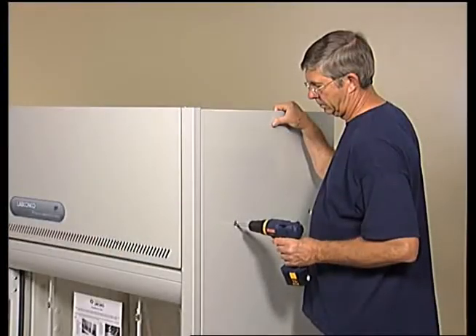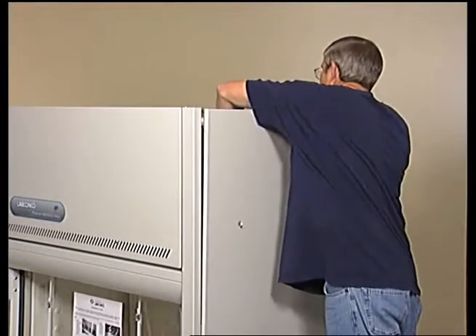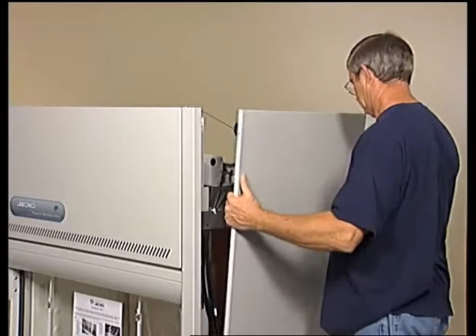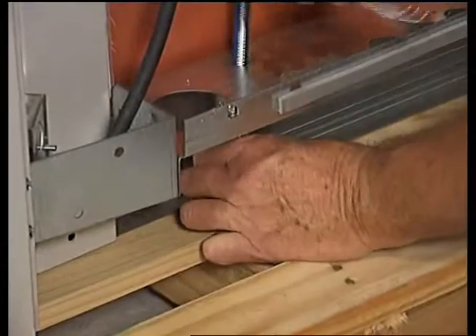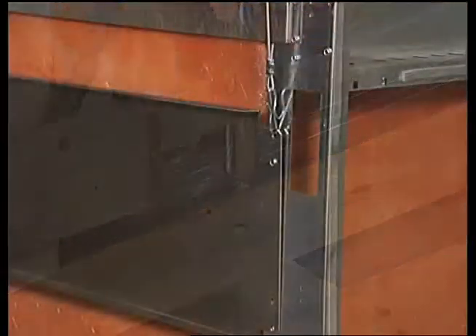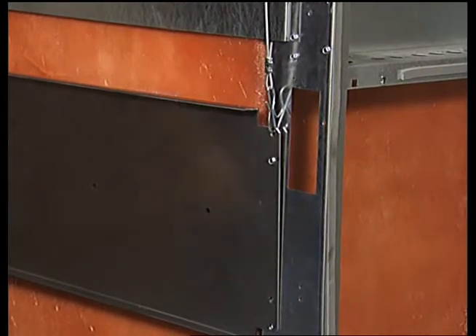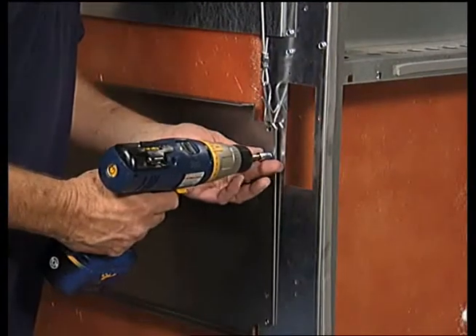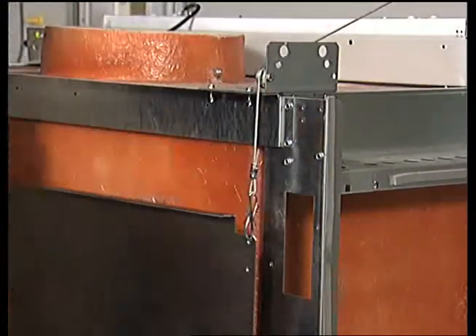Leave the fume hood attached to its shipping skid until it is as close to its final location as possible. Remove both side panels by removing the Phillips screws. Remove the four bolts that secure the fume hood to the skid. To protect the fume hood from damage during shipment, the sash weight has been secured to the back of the fume hood with four screws. Remove the screws and make sure the sash cables are on the pulleys.